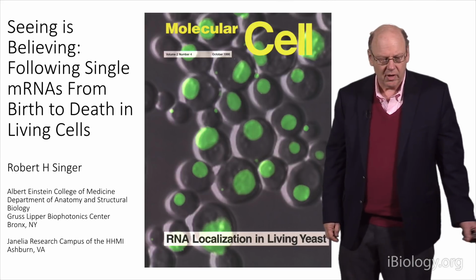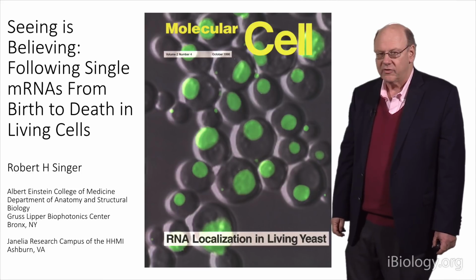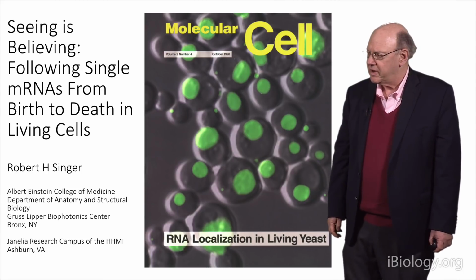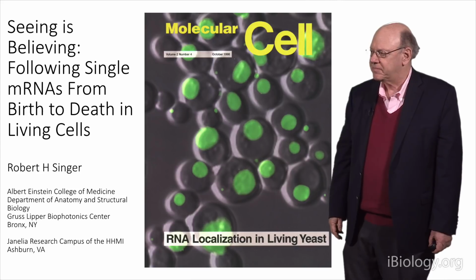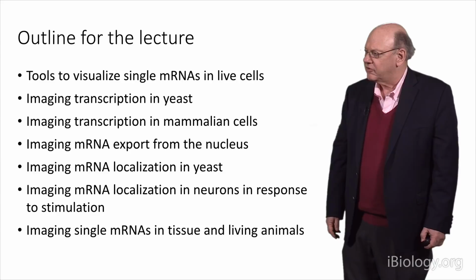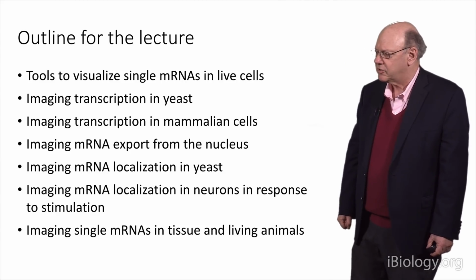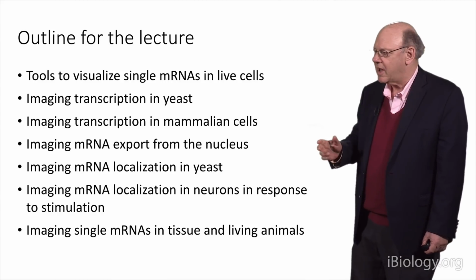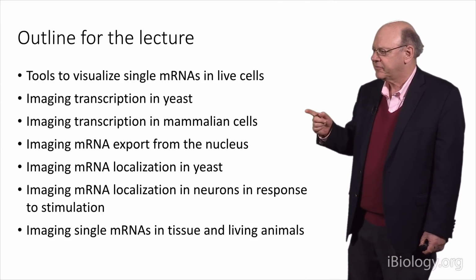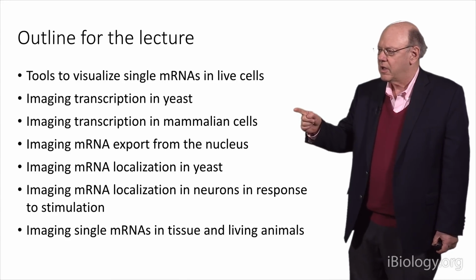And I talked to you in the last lecture about seeing individual RNAs in fixed cells, but now we need to develop a new technology to see it in living cells. So let me just describe what I'm going to talk to you about. I'm going to talk about how we develop tools to actually see RNAs in live cells.